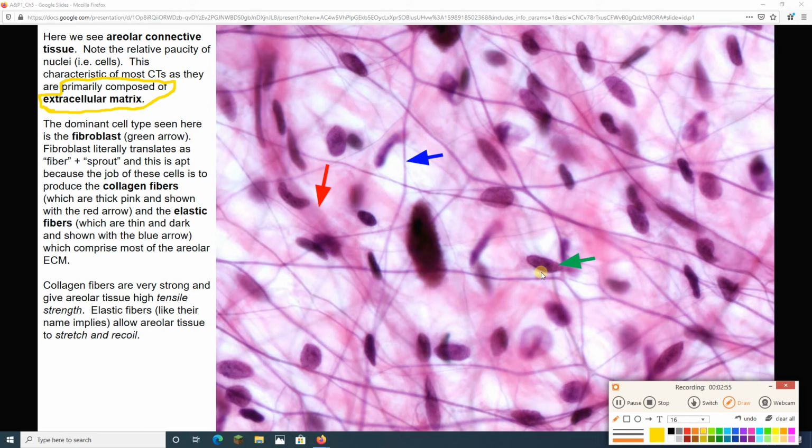The fibroblast makes fibers. Fibers, of which we see a bunch in here, are great for connective tissue. This is because connective tissues are for protection, for connecting, for support. Fibers do this wonderfully.